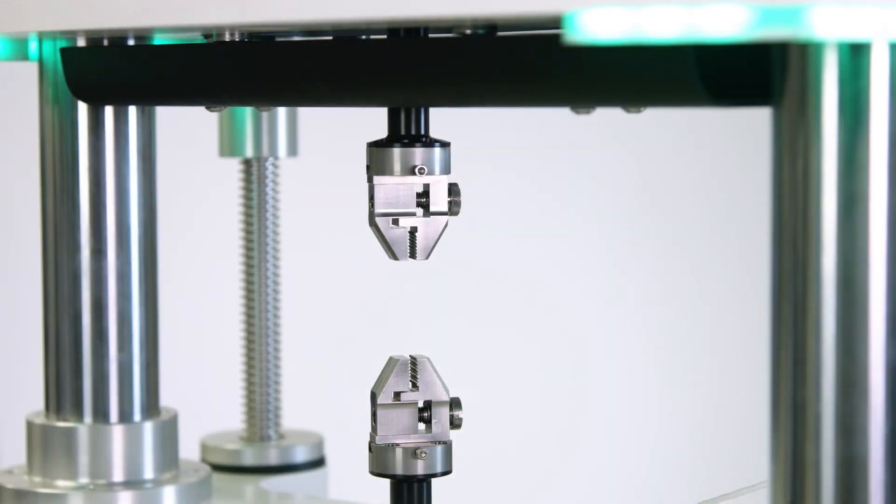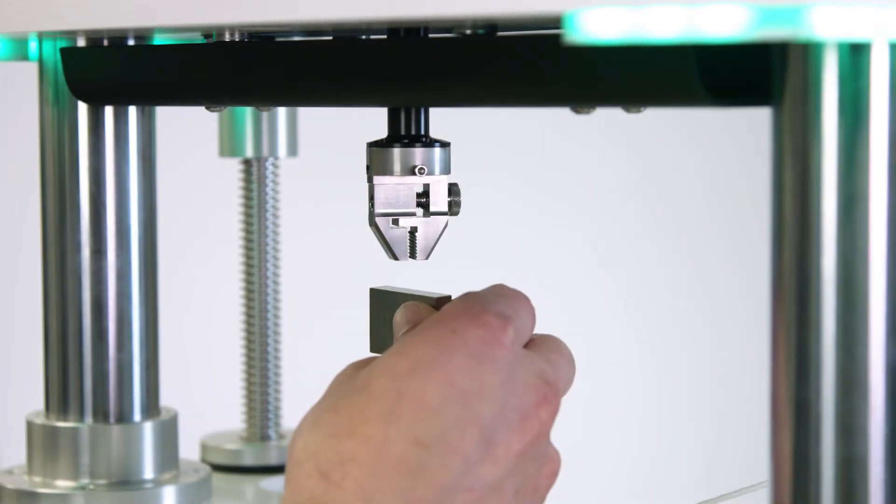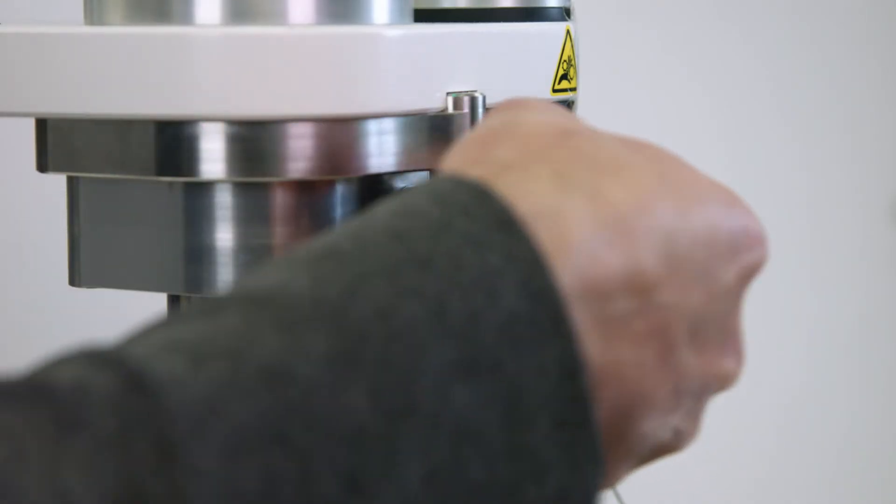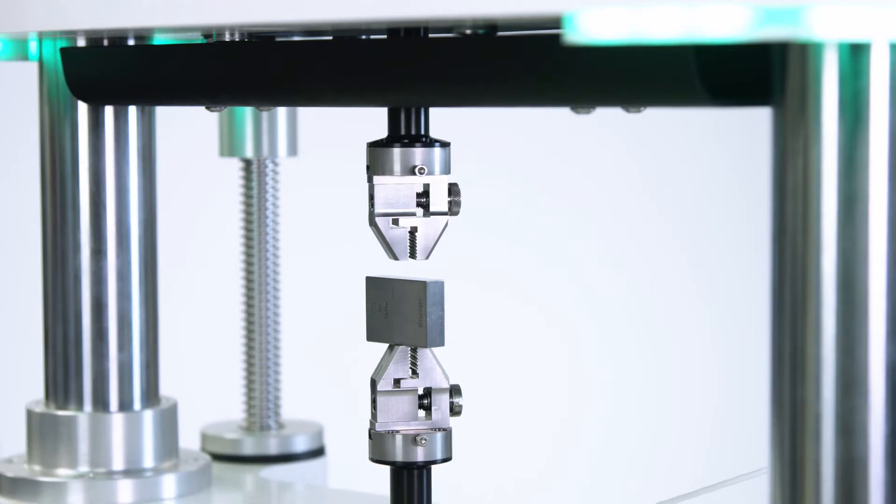I can use a gauge block to provide a known measured reference length to the software. I insert the gauge block between my grips and move this close to the position of the upper grip.